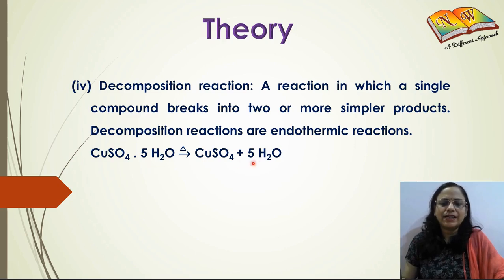On heating, the water escapes in the form of water vapor, resulting in the formation of anhydrous copper sulfate, that is only CuSO4, which causes a change in the color. This reaction can be said to be a physical change because as soon as you leave the crystals exposed to air, I mean the white crystals, they will again turn blue by reabsorbing the moisture from the air.